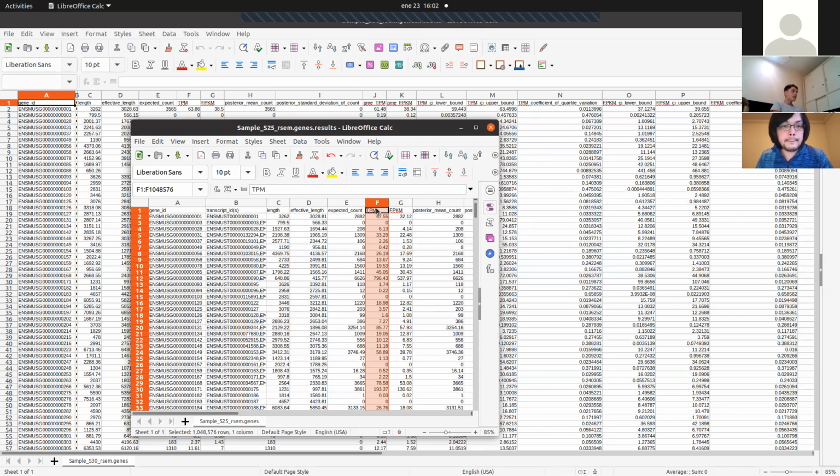So here, it is pretty much the data that I will be using for the analysis. I look at the gene, I look at the TPM count, and I compare it between one treatment and another. So the TPM is the gene expression level. When you make a bar chart showing the gene expression level, you simply use these TPM values for each sample.